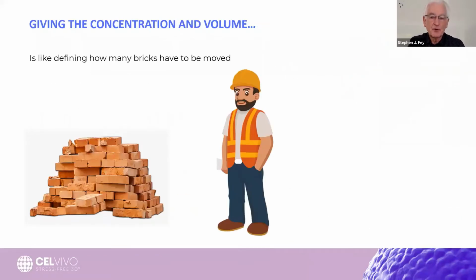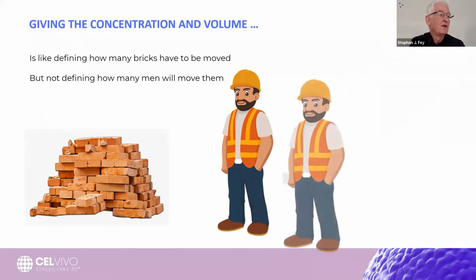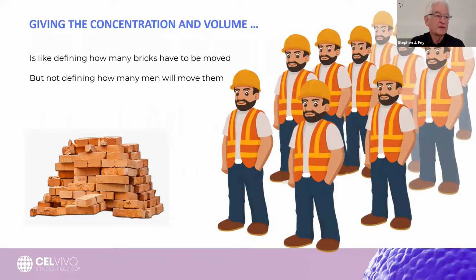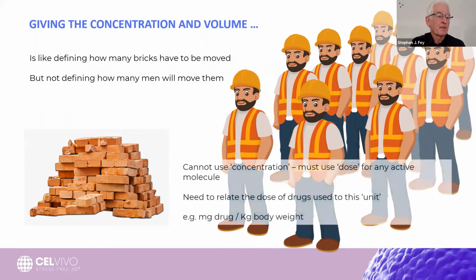The next point I want to make is that giving the concentration is actually like defining how many bricks you have to move, but not defining how many men you'll have to be moving it. So it's only giving half of the story. You can't use concentration for your active molecule, you need to use dose.